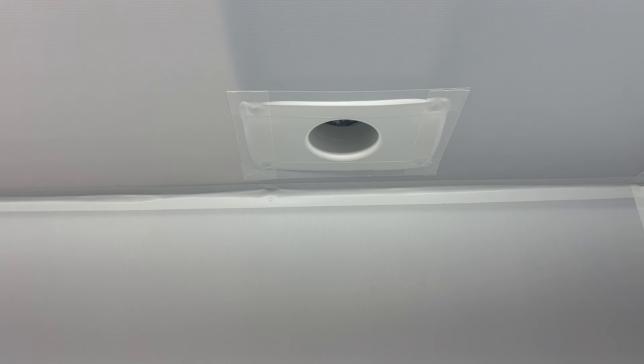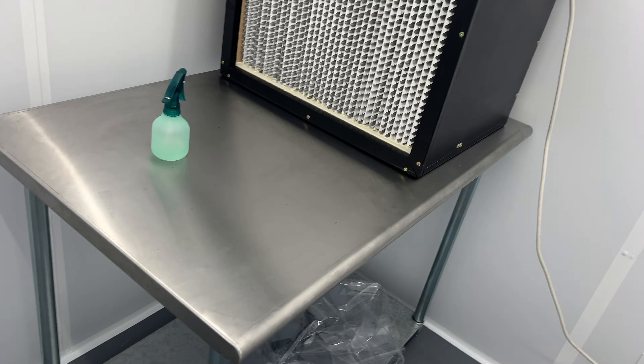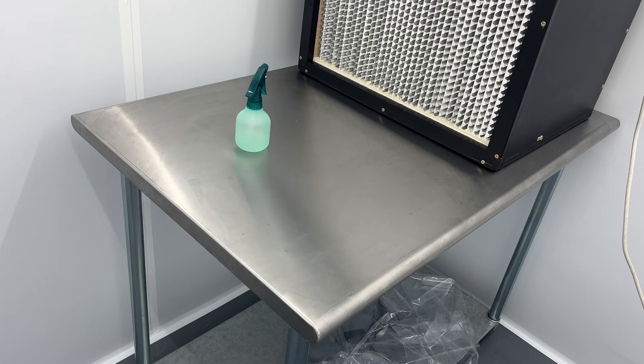What this ducting allows is for the air to move out of the filter and then up and out of the way, creating a nice straight column of air coming out towards the duct, which is just going to be a lot better for working. Over here we have the other end of that intake duct I was showing on the outside — that's where the clean air comes in. There is just a slight crack in the door, and this is where most of the air exits, keeping the room positively pressurized so any cracks will have air flowing outward rather than contaminants coming in. I got the T5 LED lighting up here — makes it nice and bright. The flow table is stainless steel, which is very important — makes it easy to clean.